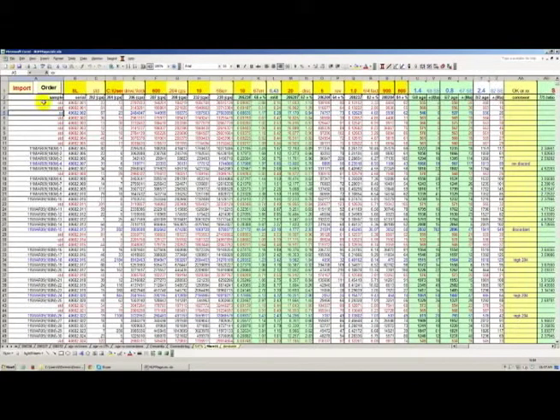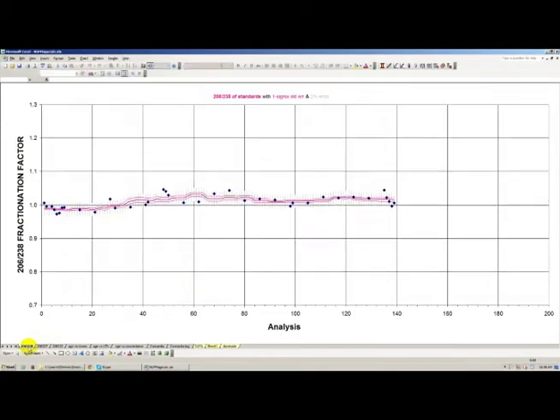Then the next one was number 28. If you count from number 3, then plus 28 is going to be cell number 30. If you go down here to cell number 30, in fact, this is the other one that has an anomalously young age, and again, lowercase x. You hit enter, and that one turns blue again. And if you go to the 6-8 tab, you'll see that those standards are not in there anymore. And then our 2 sigma uncertainty envelope on that mean systematic fractionation factor.